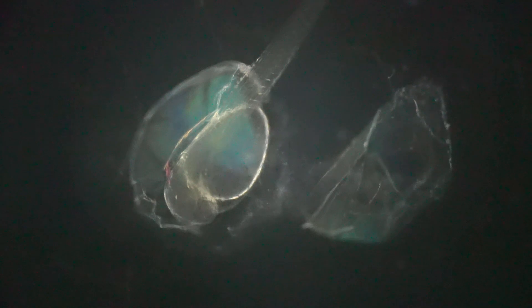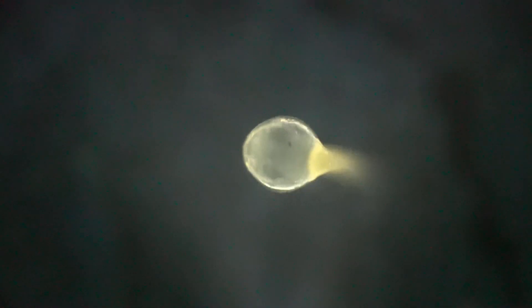You can definitely see the yolk sac, the tail and the head as well as the eye. The eye is not completely developed or very dark yet. So there's the one fry that's still hanging out in the membrane chilling out, and then I had to go looking around the petri dish for the other fry. Now the other fry was floating at the surface with its tail facing down, so it was looking straight up at me into the microscope which was really crazy. You can see his two eyes that are still kind of developing. Very light colored eyes at this point and just faintly can make out a mouth there.